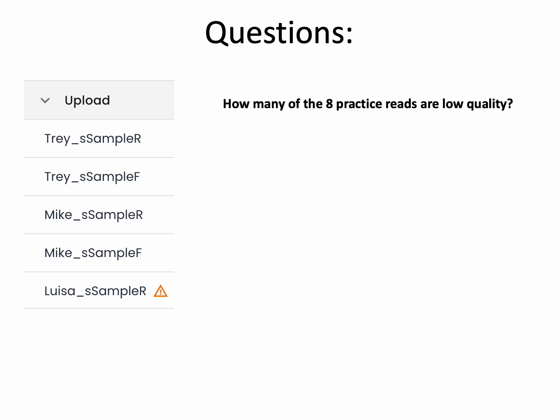Question: how many of the 8 practice reads are low quality? Please hit pause until you know the answer. So the answer is 1. Only Louisa's reverse read. That's the only practice read that has one of those exclamation marks.